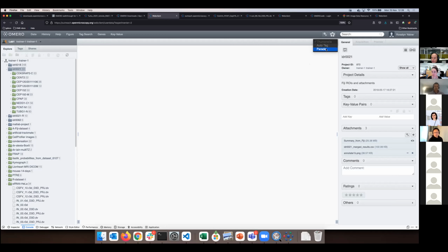There is a menu item above the right-hand pane which says Parade. Thumbnails, auto tag, and Parade. I will click on that Parade, and nothing really will show because Parade is working only with open datasets, and all my datasets inside that project are closed.